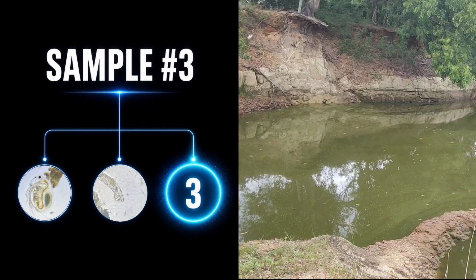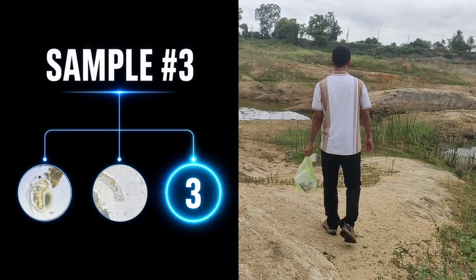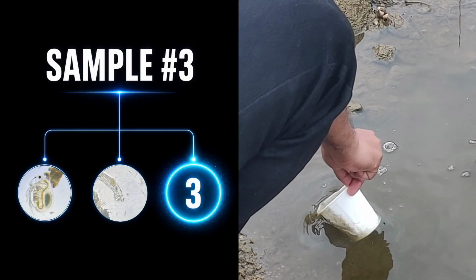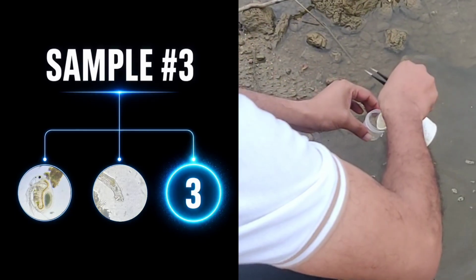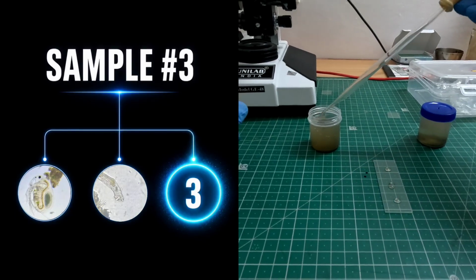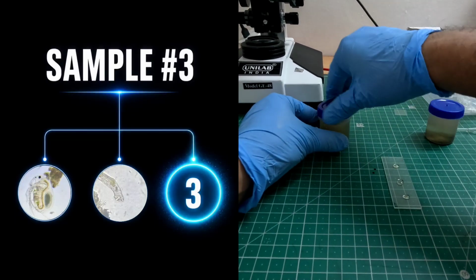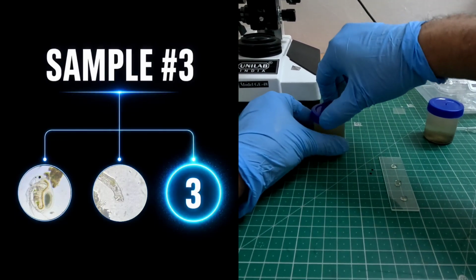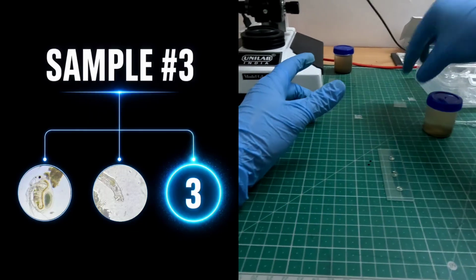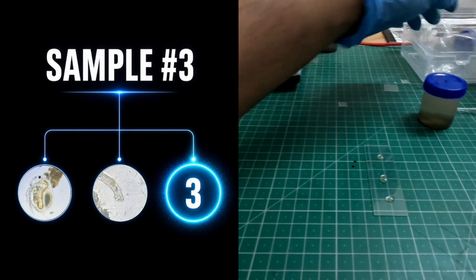A quick recap for anyone just joining. This third organism we have discovered from sample 3. If you haven't seen where this sample came from, go check the sample 3 compilation video linked above, and in it you will find both microorganism 1 and microorganism 2, which we covered earlier. But today it's all about microorganism number 3, and honestly this one might be the most visually satisfying and historically important organism we have filmed yet.